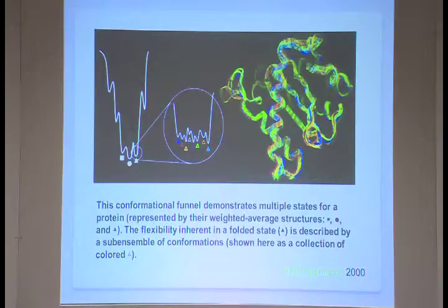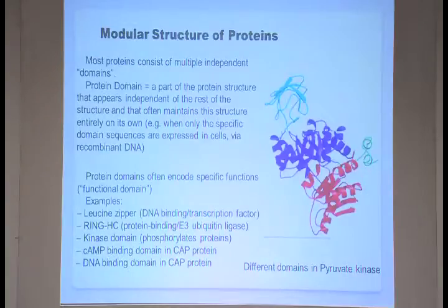We know why we want to do this flexible fitting. We know that proteins are actually weighted averages of many structures. And can we really say in a cryo-EM map what the structural differences are in these regions? After ligand binding this changes, and it has a different weighted average again. We cannot say. So how much can we really say from low resolution or medium resolution maps?